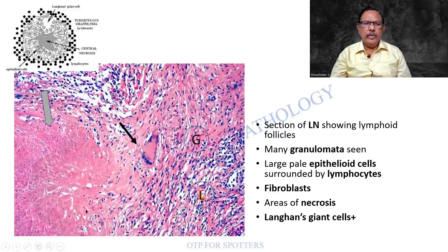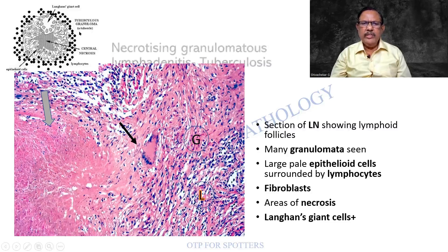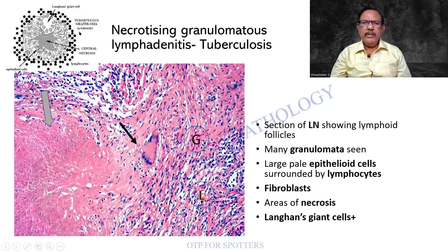Look at the area of necrosis. This kind of picture will be focused for you in the exam. And this is just a line sketch of it. The diagnosis is necrotizing granulomatous lymphadenitis — tuberculosis.